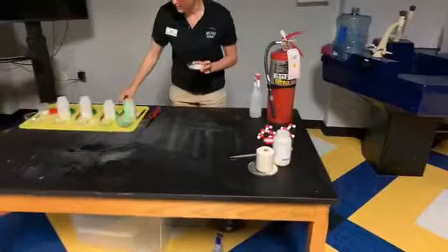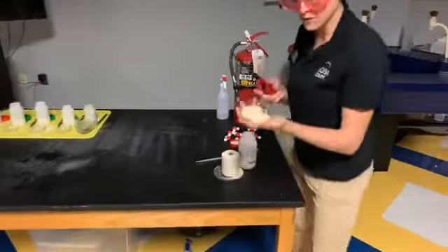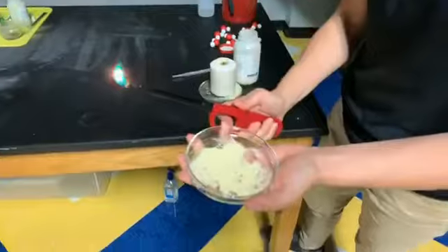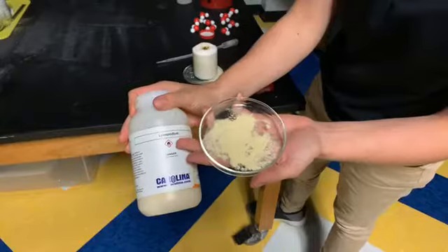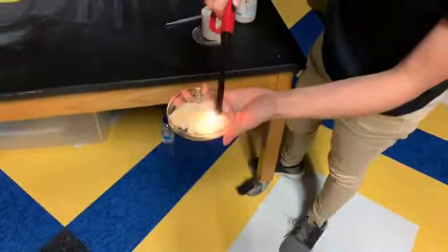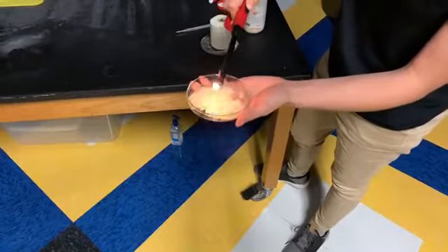Let me make sure I put out this green fire before I move on to my next experiment. Okay, so if you can get a good view of that fine lycopodium powder, we've got our heat source, we've got oxygen, and we've got a fuel. It is very flammable, as you can see from my warning sign here. So let's see what we can get. Nothing. Any ideas why it's not lighting on fire? We have all three of the ingredients.